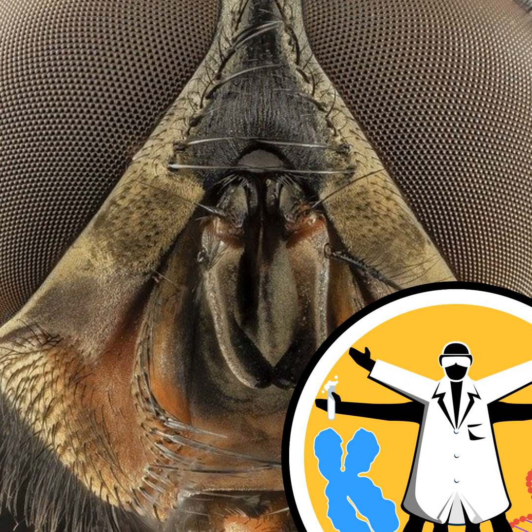Ed, we gave them to you. What did you do next? I took one fly and basically dunked it in an extraction buffer to get the DNA out, but tried not to disturb the fly too much. So we would just get the things on the outside. And then with another fly, I mashed it up really well, which was quite disgusting, and then dissolved that all in lysis buffer. So we have this comparison of potentially what's in the fly and what's on the fly.